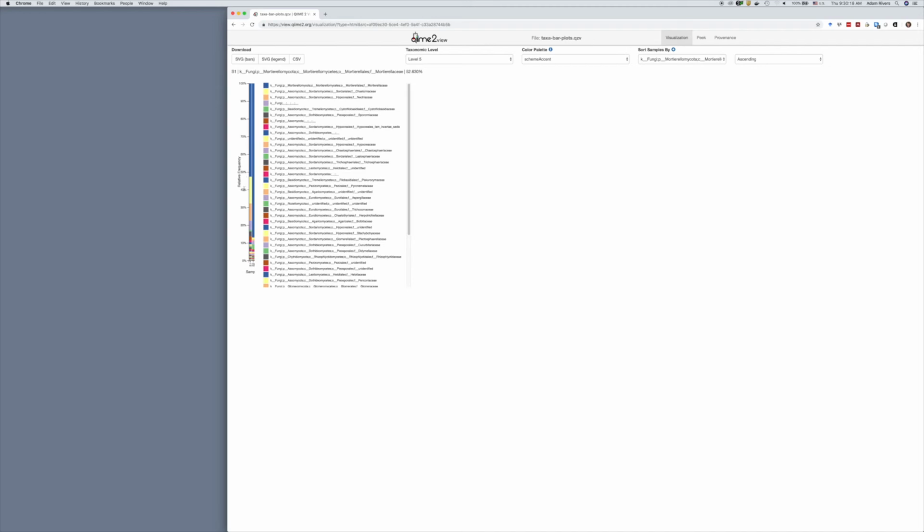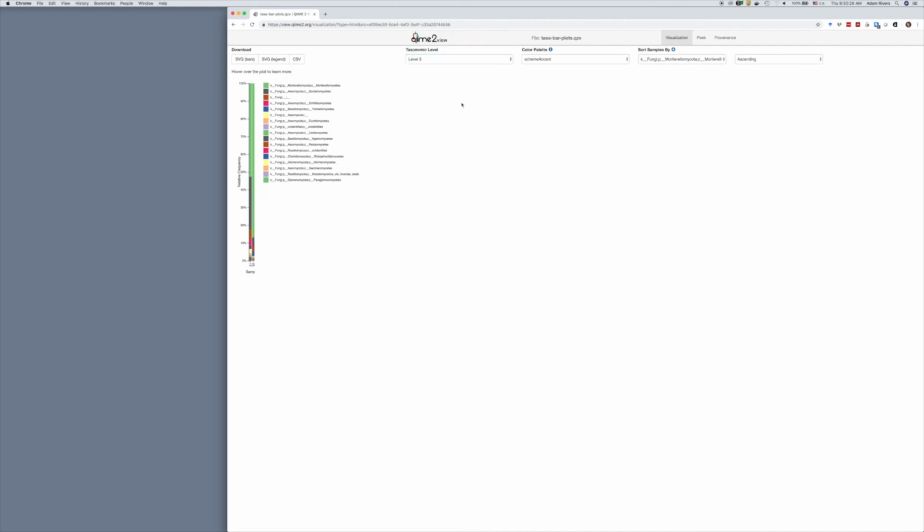The sample appears to be dominated by just a few organisms, but there is a wide range of other organisms if we go down a little further in diversity. We can again set that level to a little bit higher if we want a more summarized view of the data. Multiple export formats are available. You can export the data as CSV format, or you can export an SVG format with just the bar plots or with the legend as well.